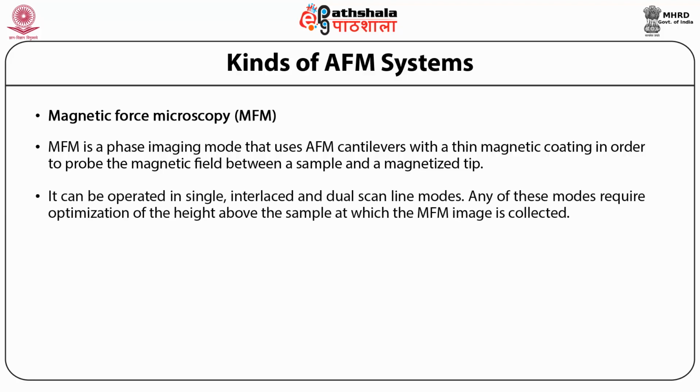It can be operated in single, interlaced and dual scan line modes. Any of these modes require optimization of the height above the sample at which the MFM image is collected.